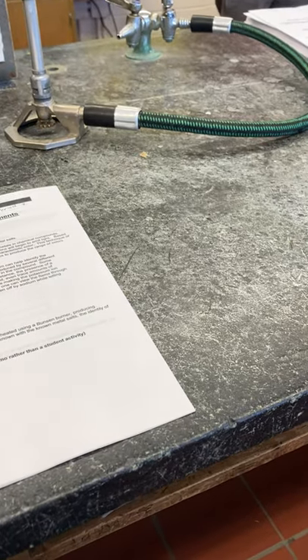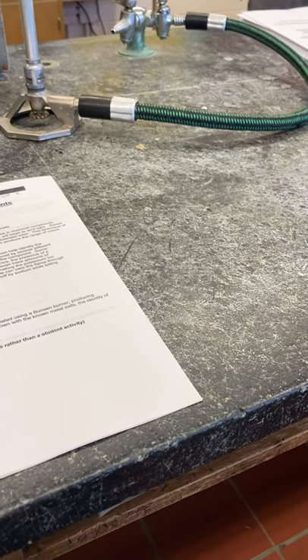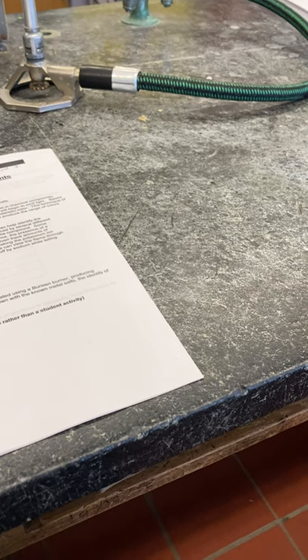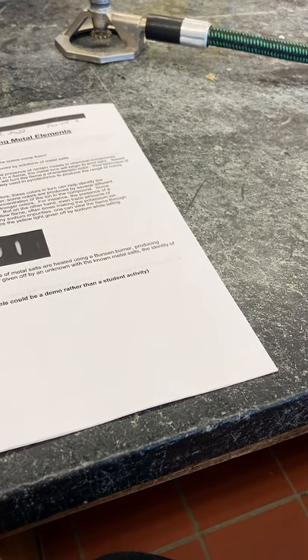A flame test is a procedure used to test for the presence of certain metals in chemical compounds. When the compound to be studied is excited by the heat in the flame, the metal ions will begin to emit light. Just like we're talking about ground state and excited state, that's what we're creating here in the lab. Certain metal ions will turn the flame very distinctive colors. These colors in turn can help identify the presence of particular metals in the compound.